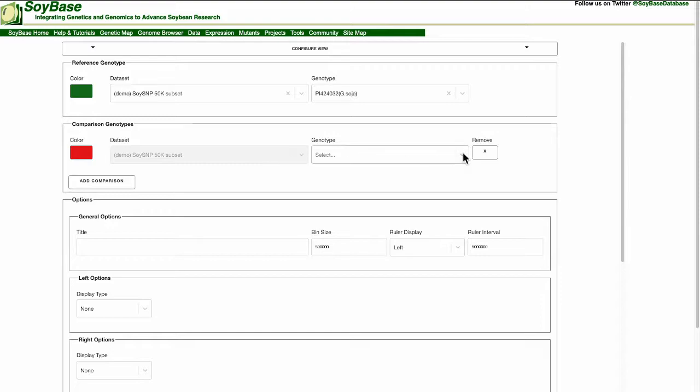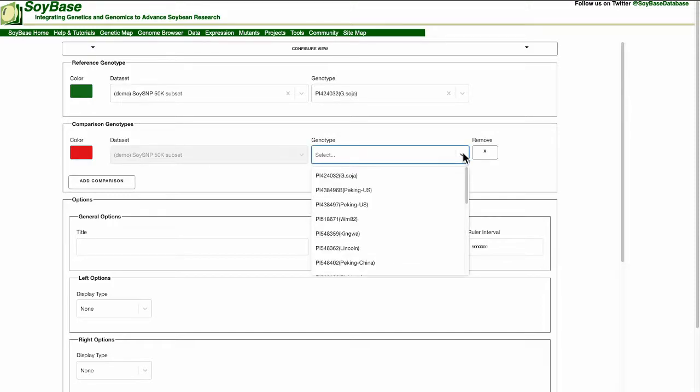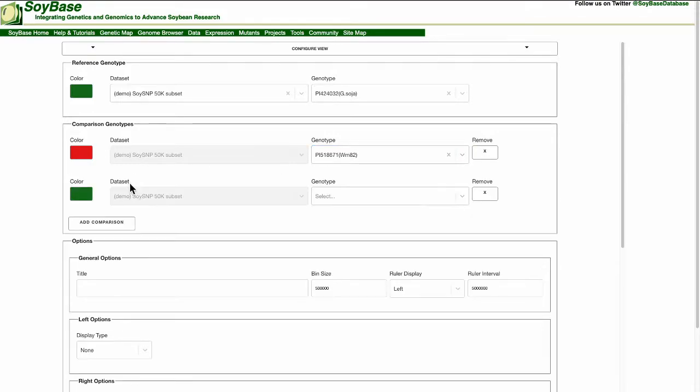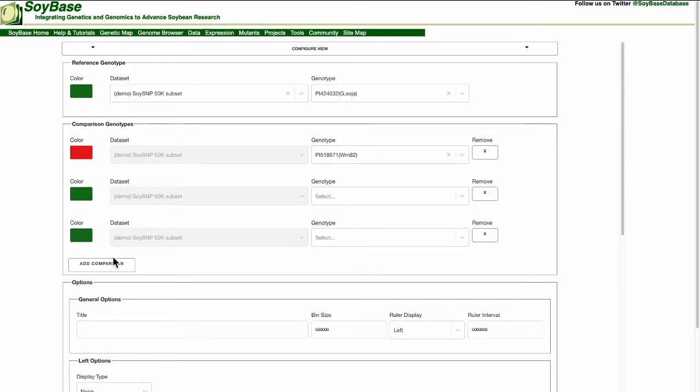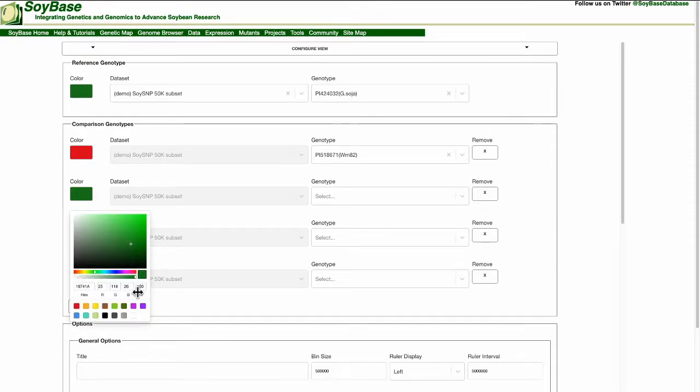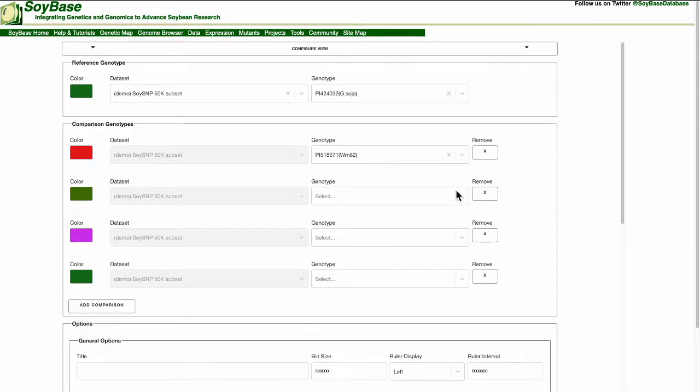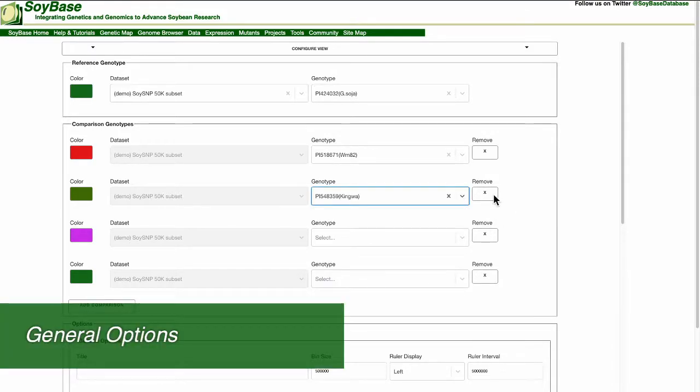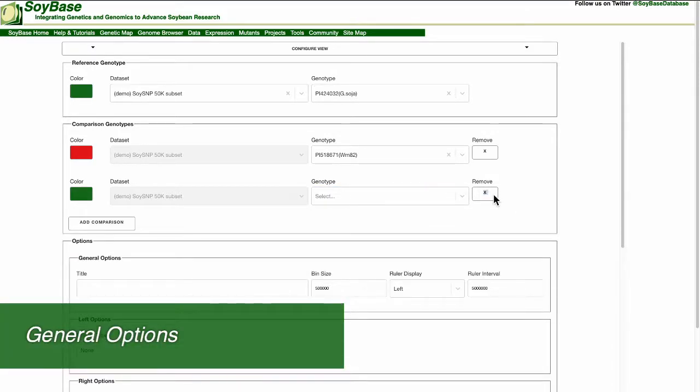Finally we select the genotype we want to compare to GSOJA. In this demo I'm going to choose PI 518671 or Williams 82. In addition I can add another line to compare but in this tutorial I will only be using one. Next we will move on to the display options.